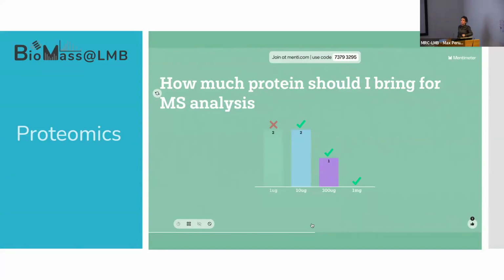You just have to work a little bit more in order to make sure that your scaling up is not actually ruining your experiments. For standard quantitative proteomic analysis, we usually work between 100 to 300 micrograms. And the reason is mostly driven by what do you want to know. If you're working on the whole large-scale standard proteomic quantitative analysis, maybe 50 micrograms is enough, because what we'll do is we'll multiplex your samples. So in the end, we end up with 1 milligram that we can inject in the mass spec.